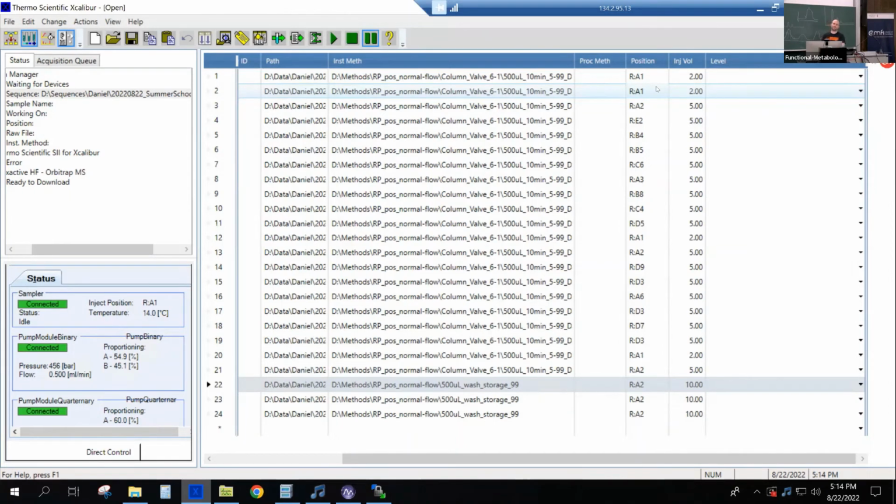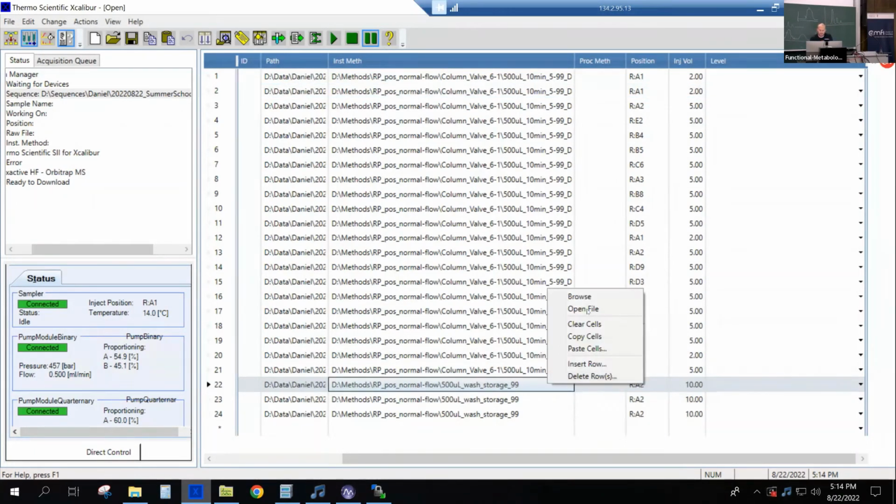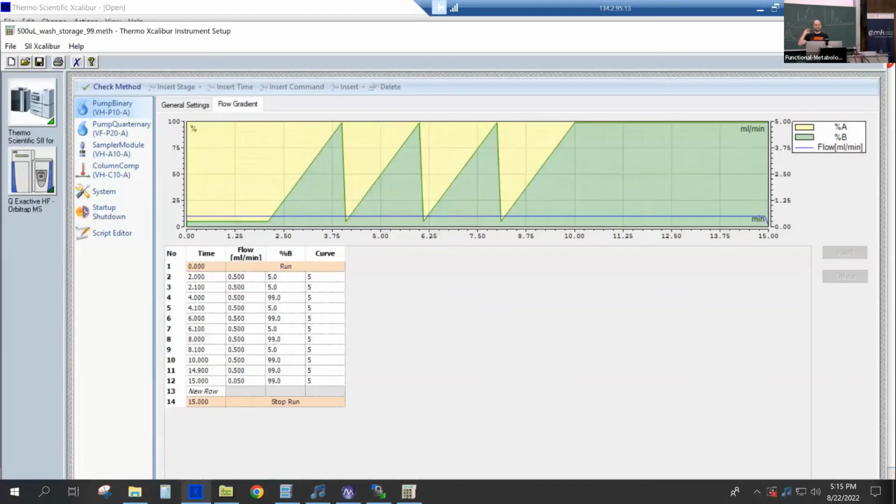Also a short question. In the washing phase of the chromatography, do you also acquire the MS2? No, no. I can show you how. Let me show you that method too. That's only MS1, and we basically just delete it afterwards.